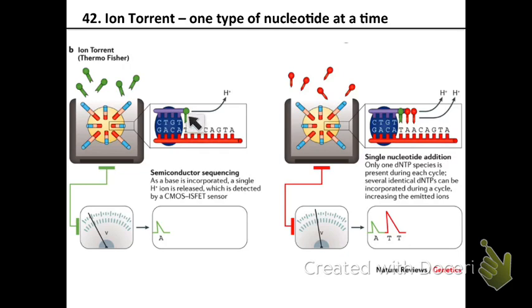Whenever they add the A nucleotide, if your bead contains the DNA sequence where there's a T as the next nucleotide, it's going to add the A. And if you see a signal from your detector, you're going to say, at the cycle when I added the A nucleotides, this got incorporated into this bead, right? So I know that that nucleotide in the template was a T. When you add another A in the next cycle, is it going to get incorporated here? No, right? So you know that your next nucleotide was not a T. And then when you add a T in one of these cycles, it's going to get added, and you say, okay, in this bead, the next nucleotide was A, right? So every time you add a nucleotide and you get a signal, you're going to have the sequence of your template. And that's essentially what this technology does.